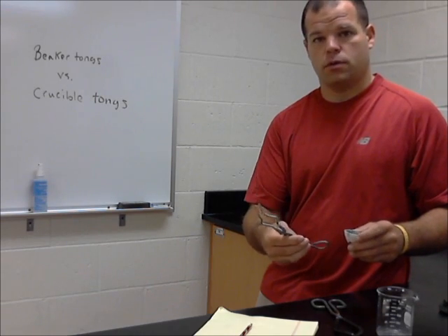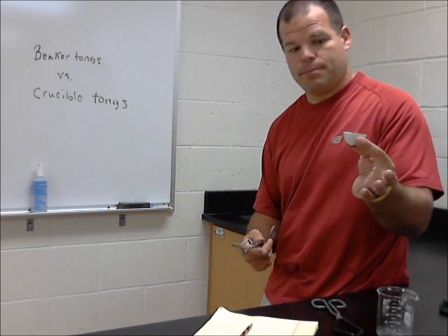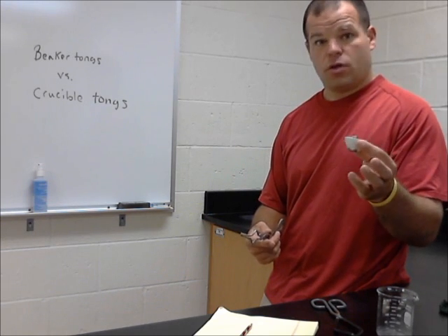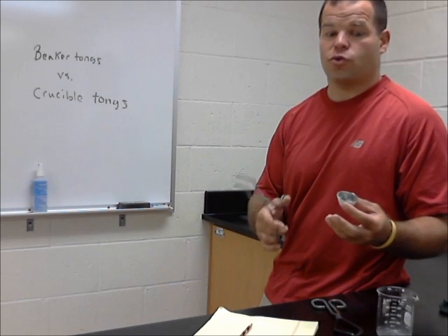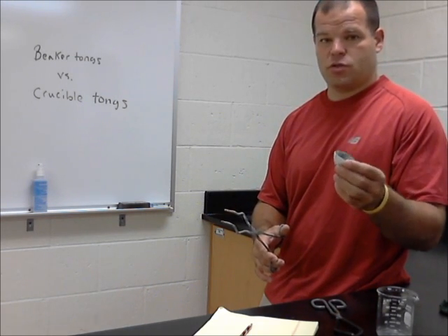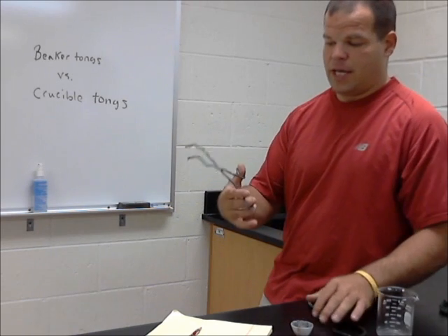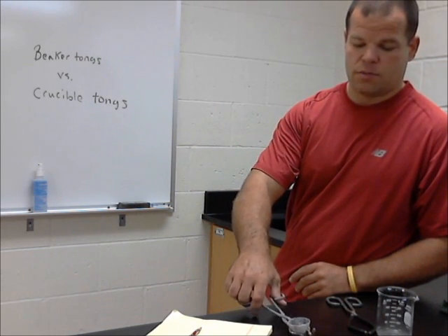Now, a crucible is this device here, essentially a small little cup used to burn things in. So it can be hot as well. Very often it's hot. Sometimes we even want to weigh it, and we don't want to wait for it to cool off, so we'll weigh it when it's hot. The way I transport this is if it's cold, I use my fingers, but if it's hot, I'll set it down on my paper here, or on the counter, even better yet. Take my crucible tongs and just slide under them and then just pick it up.